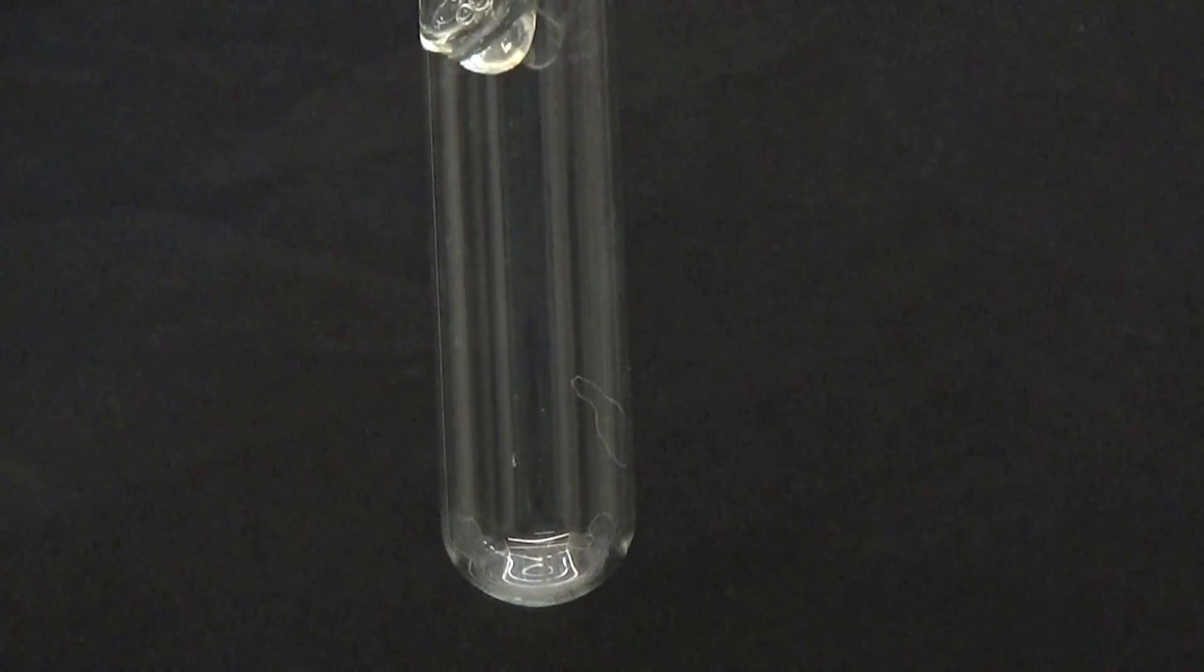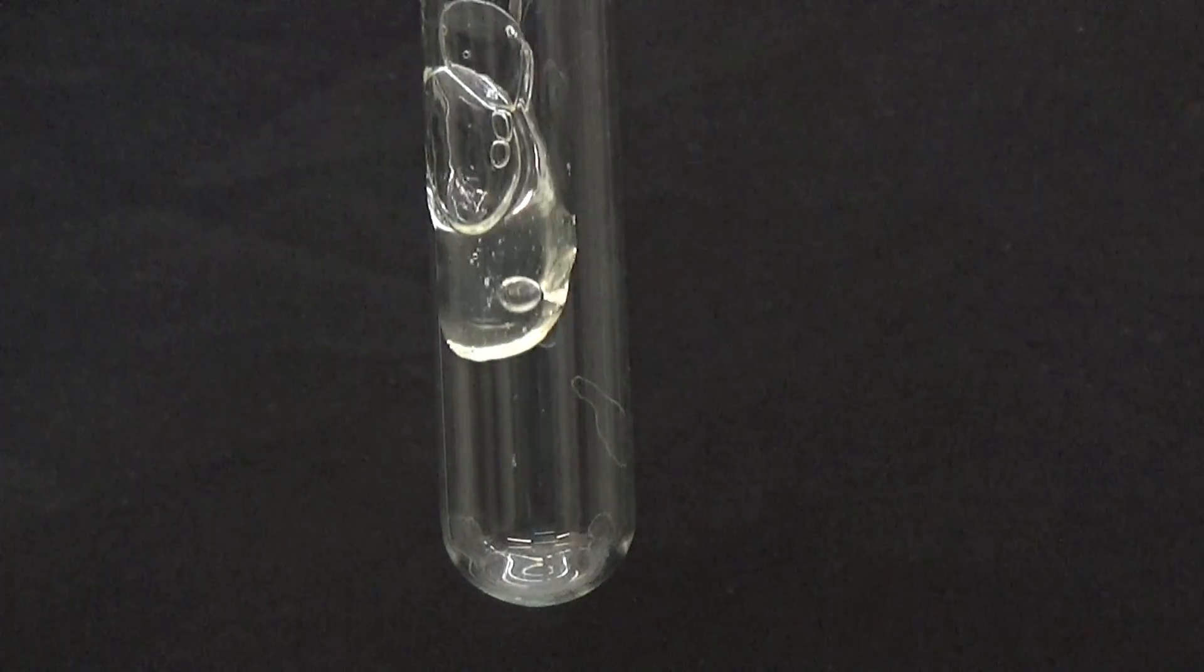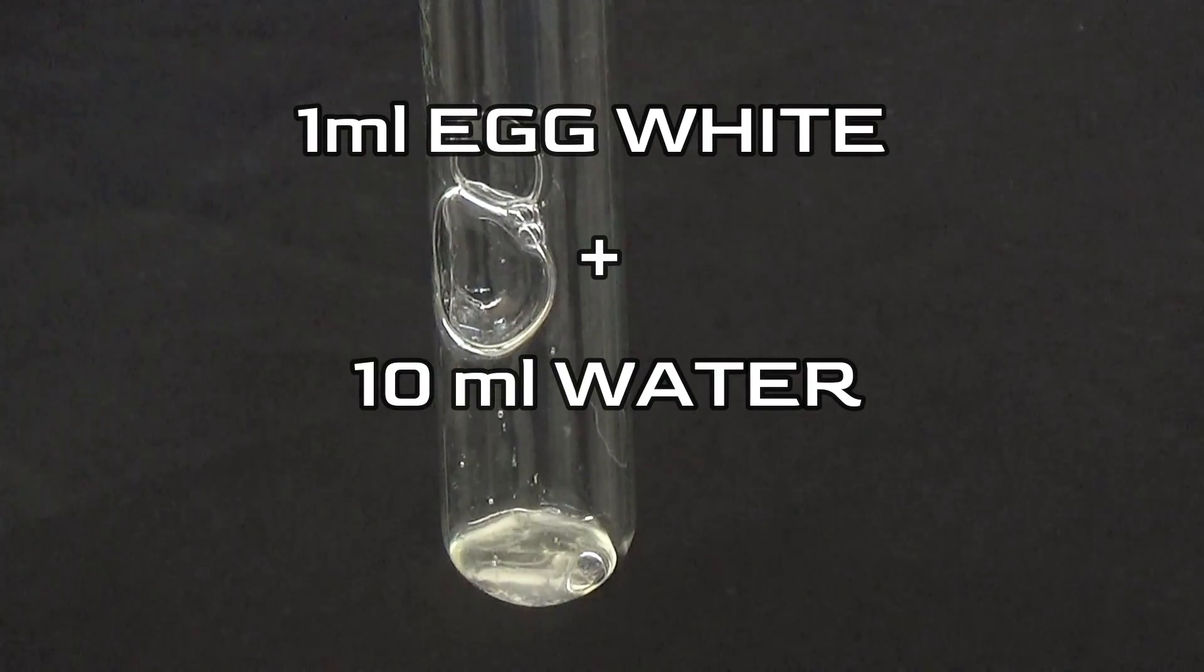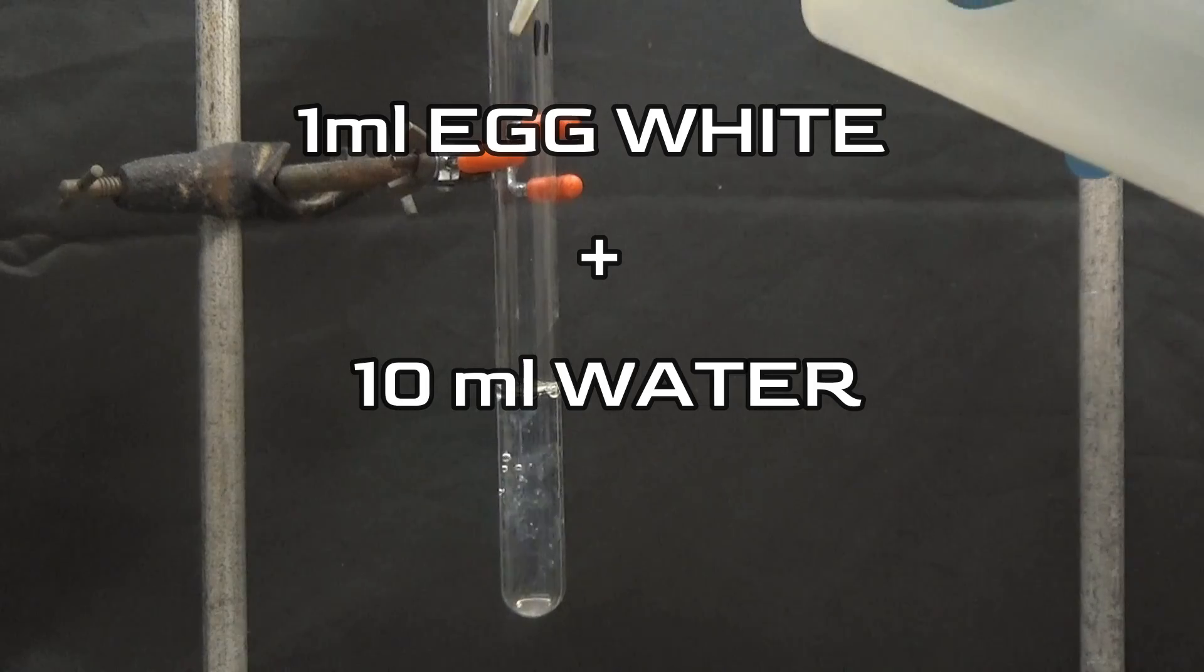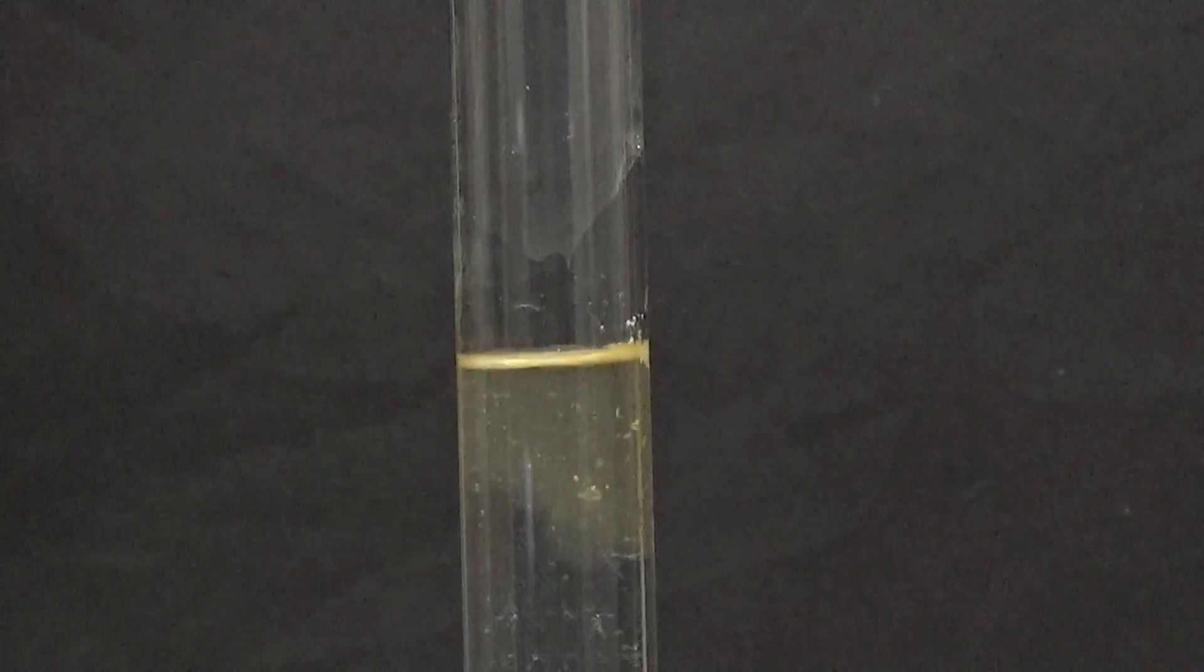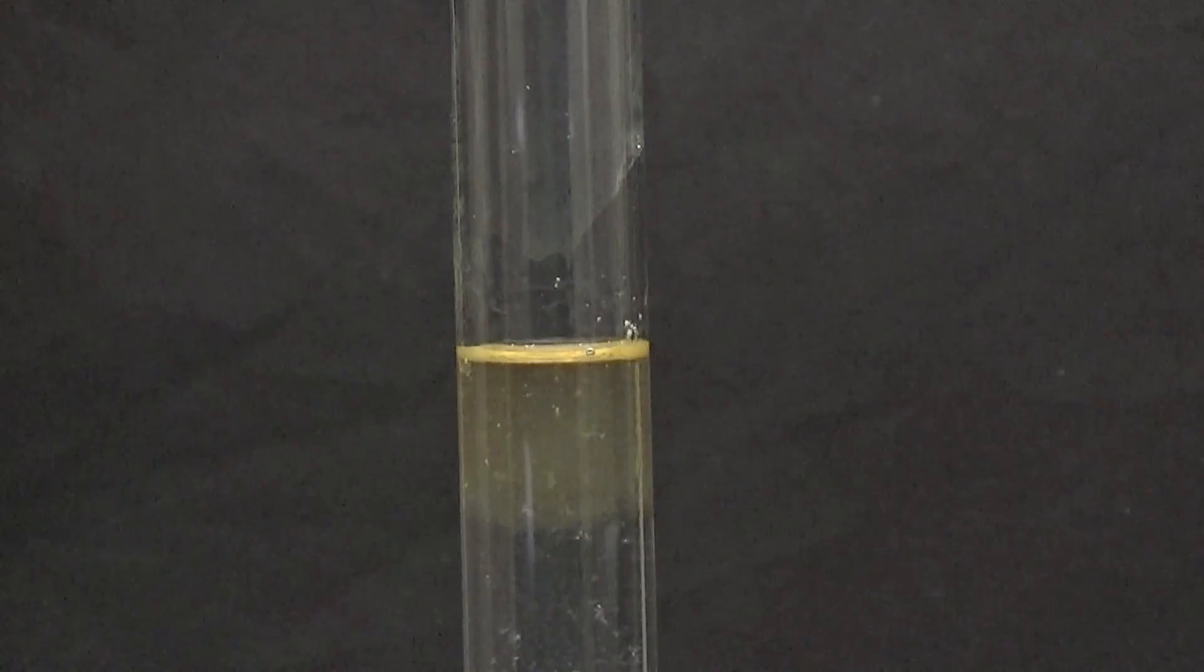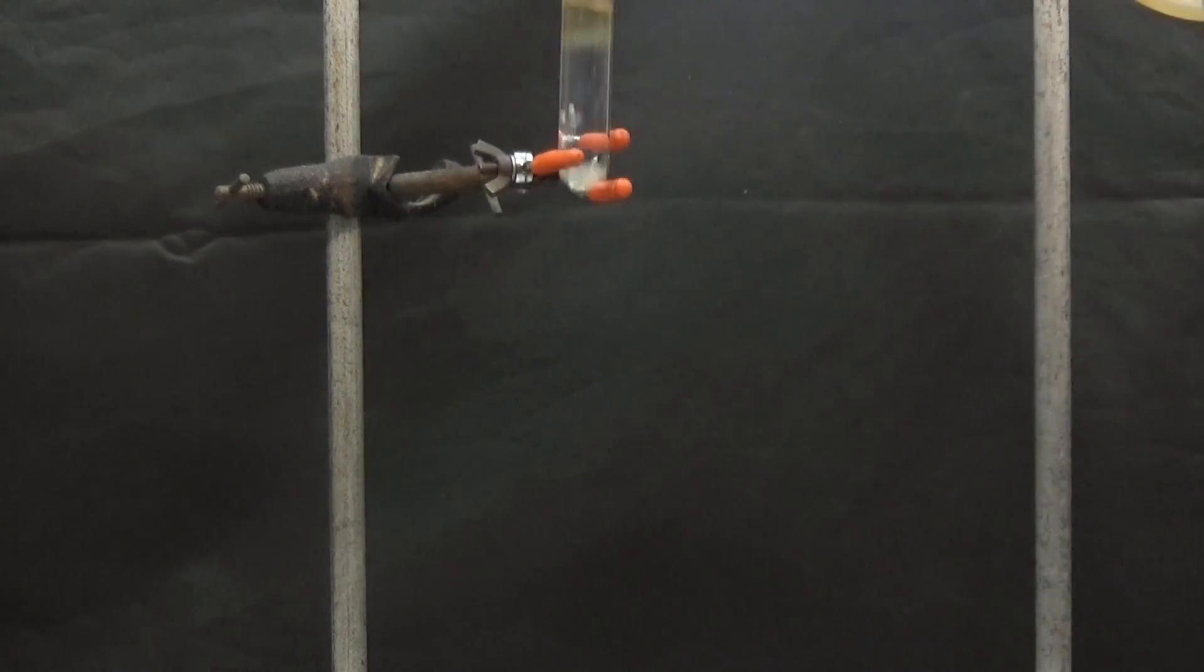We are performing this test with egg white. We add 1 ml of egg white to a tube and mix it with 10 ml of distilled water. 6 drops of 2% ninhydrin solution are added and placed in a hot water bath.